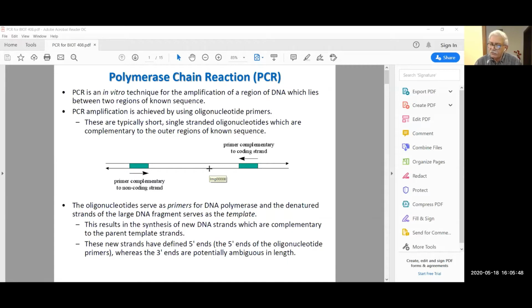If you are working with cloning a gene or a regulatory sequence, you don't want to introduce any mutations in the gene sequence. So Taq is not the enzyme of choice. Then there are some alternate enzymes, and you already read about those enzymes, DNA modifying enzymes, that is Pfu DNA polymerase, which is a high fidelity DNA polymerase. It makes much fewer mutations in the polymerization reaction as compared to the Taq DNA polymerase.